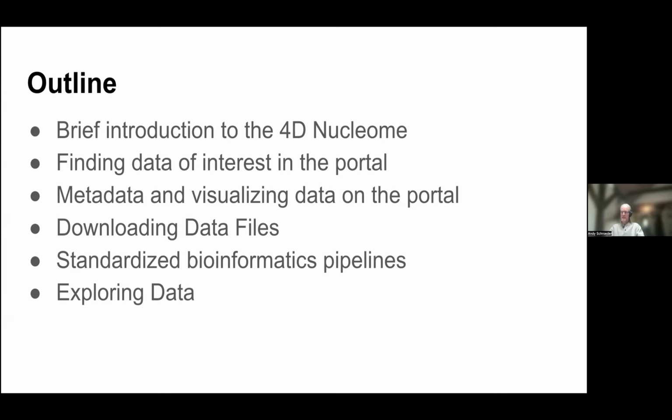A little bit about downloading some data files, the introduction about dkNET, reproducibility and FAIRness and all that. That is totally in line with what we're doing at our data portal. So I think it's very appropriate. I'm going to mention our standardized informatics pipeline and then some other ways to explore data.